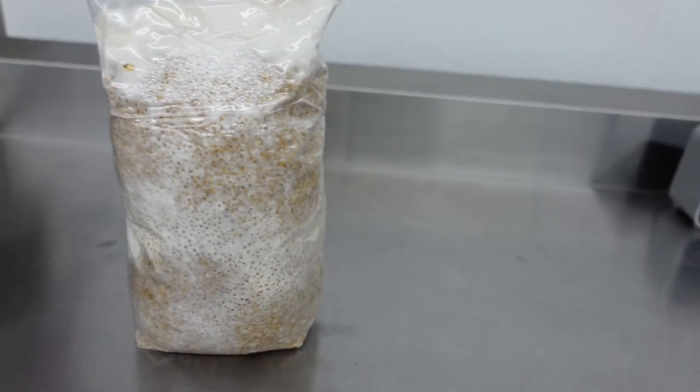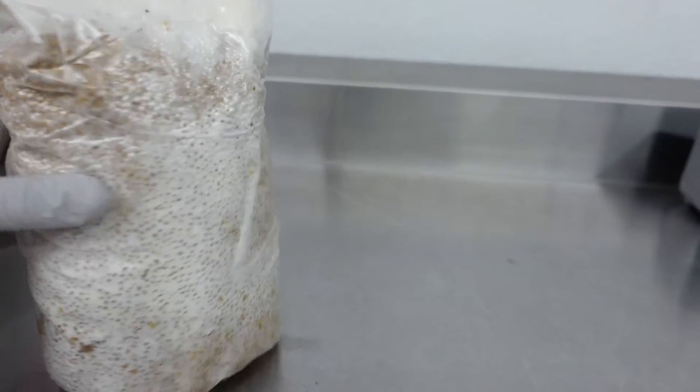Now we're going to run through the steps to make your own grain spawn, so if you've bought yours online, go ahead and skip to the next chapter of this video.